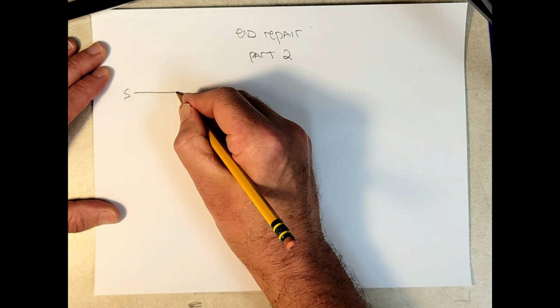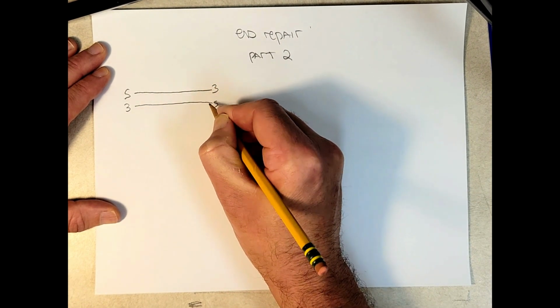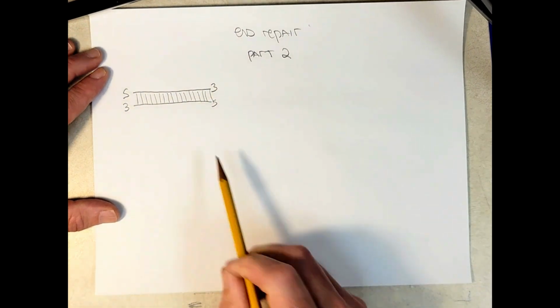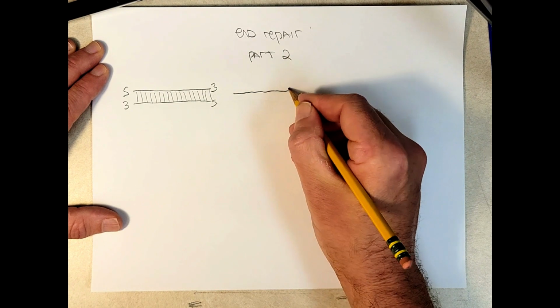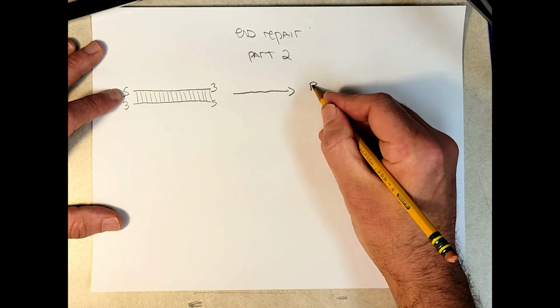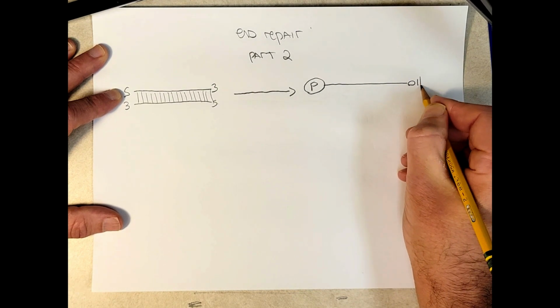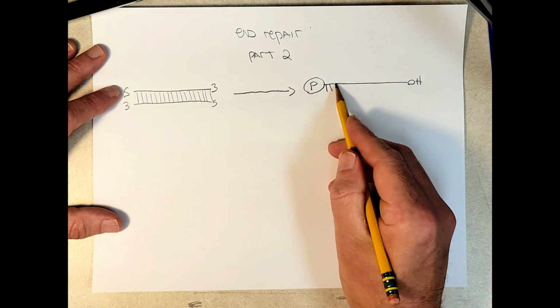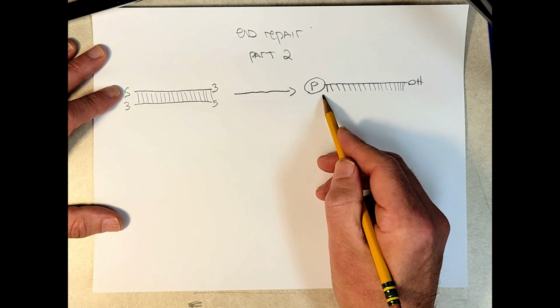So, ideally, all of our DNA molecules in the library at this point are going to look something like this, with no overhangs. No overhangs. However, we need one more thing. In order to go on to the next step, we need the 5' ends to have a phosphate group and the 3' ends to have hydroxyl groups. So the nucleotides at the 5' ends have to have a 5' phosphate, and the nucleotides at the very 3' end need to end with a 3' hydroxyl group.